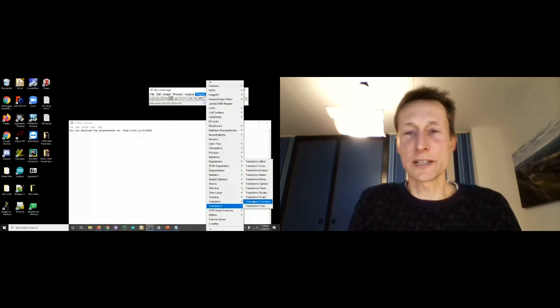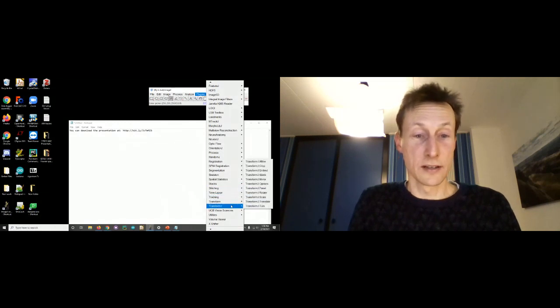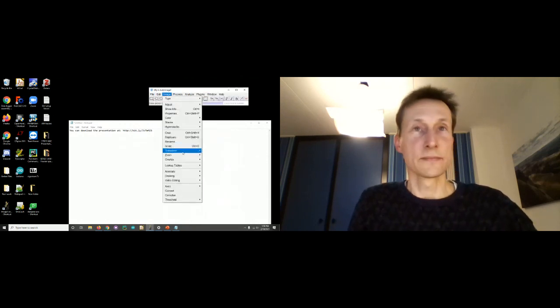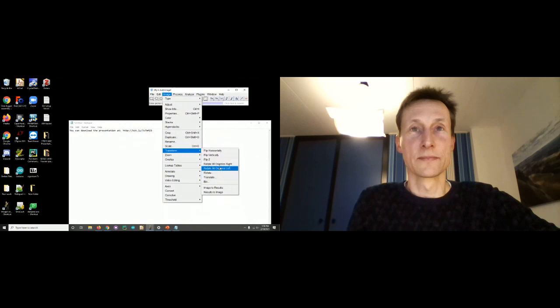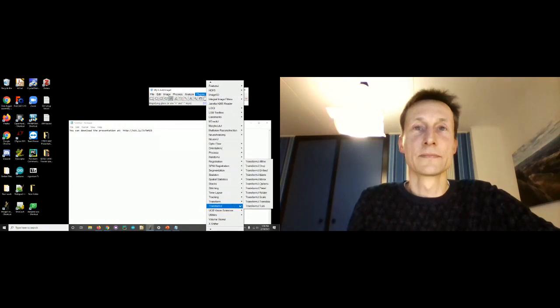Reslicing? Is that another plugin? I think it also does roughly the same, and that is standard ImageJ, but it's really slow. Yeah, no, TransformJ is like instant. It's just super fast remapping. So TransformJ is effectively the 3-dimensional version of your transform menu. So the other transforms I don't use, but that 90-degree transform is immensely helpful because so many things are easily segmented in the XZ dimension.